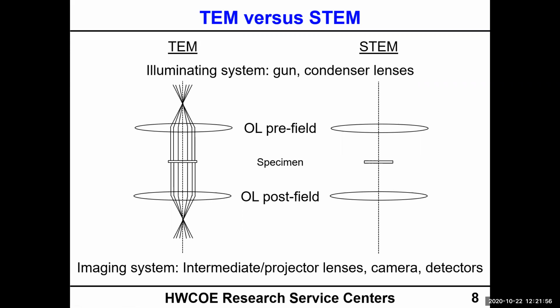Okay, if we talk about what happens in STEM mode, then we get something like this. You'll notice I didn't draw any more rays underneath here. The reason for that is that the resolution in STEM mode is basically irrelevant relative to what happens underneath the sample. It's only concerned with what happens up here. When you're talking about TEM mode, it's the opposite.